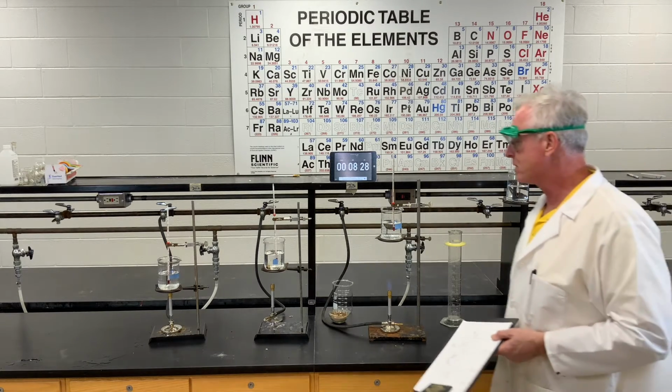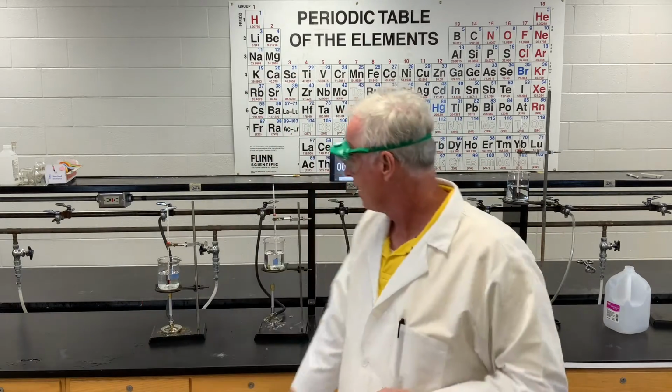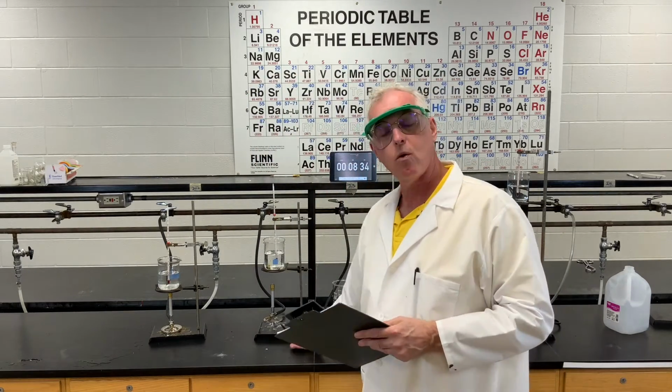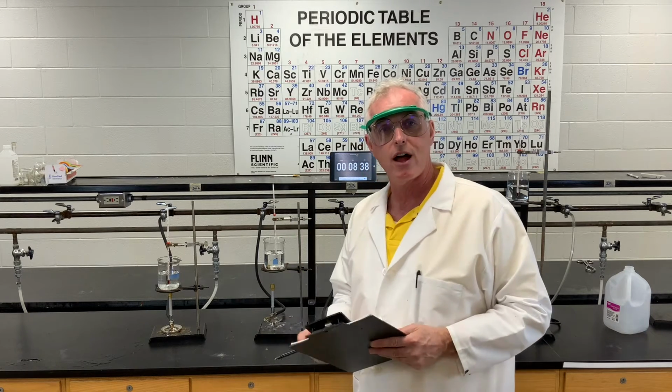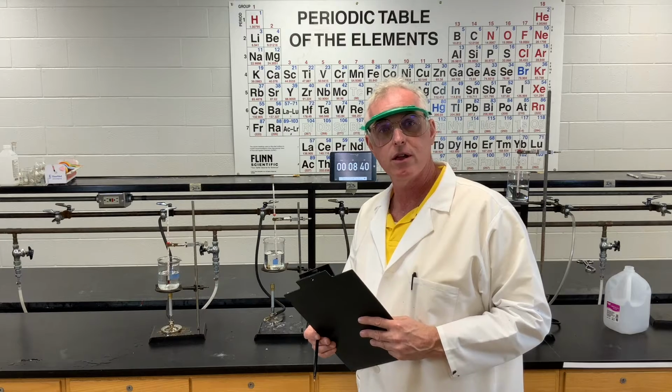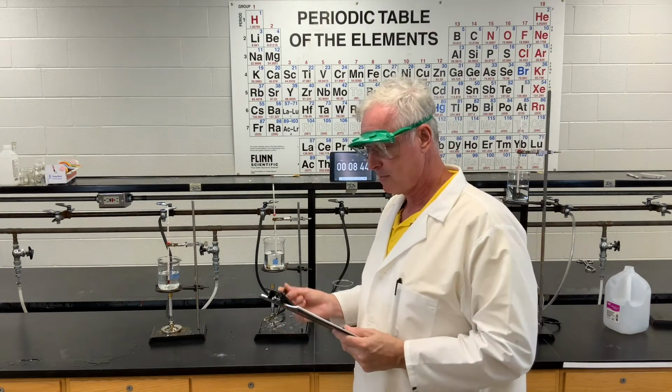So I'm going to shut this down now, but as you can see, the results of the lab are pretty clear. The best height for a burner for the hottest point is at the inside of the inner cone, at the top of the inner cone.